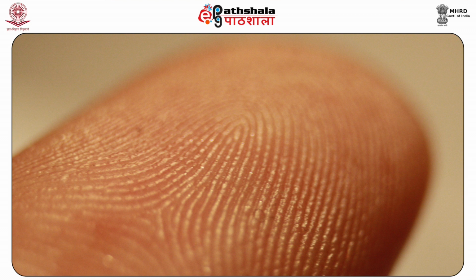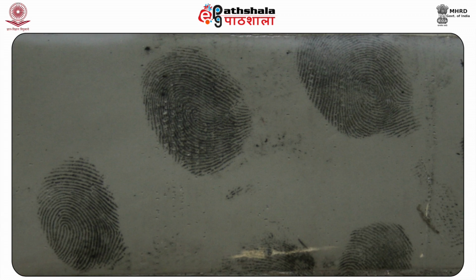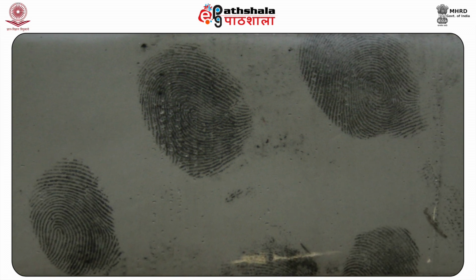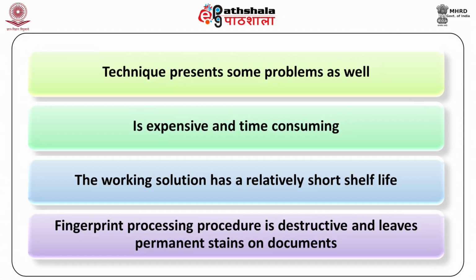Since these biomolecules are insoluble in water, the physical developer technique lifts fingerprints impinged on moist items. It also develops fingerprints on surfaces which have been exposed to intense sunlight for several hours. The technique presents some problems as well. It is expensive and time consuming. The working solution has a relatively short shelf life. The fingerprint processing procedure is destructive and leaves permanent stain on documents.